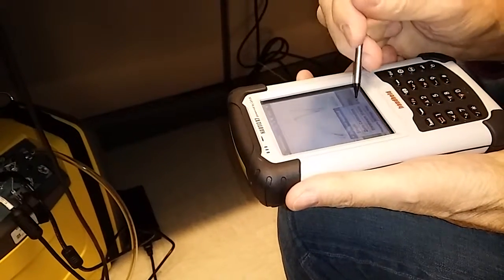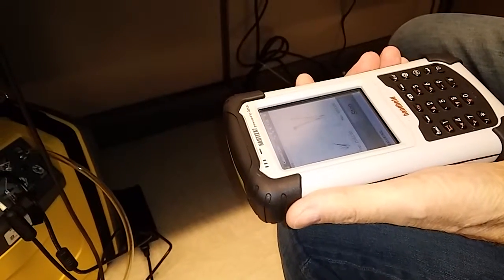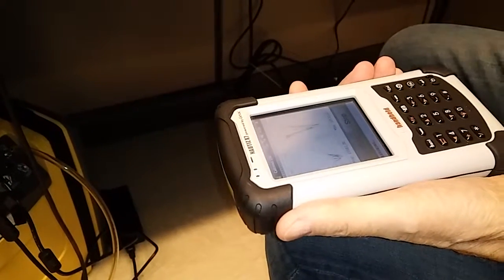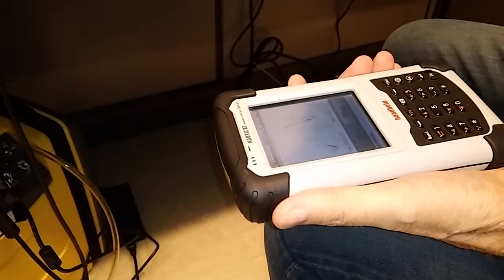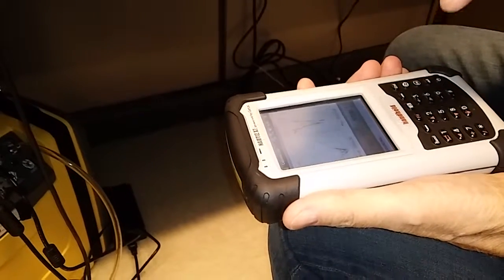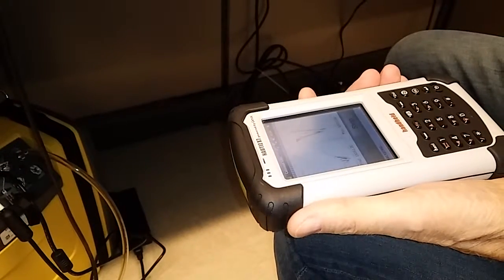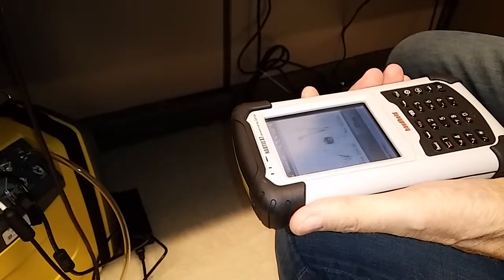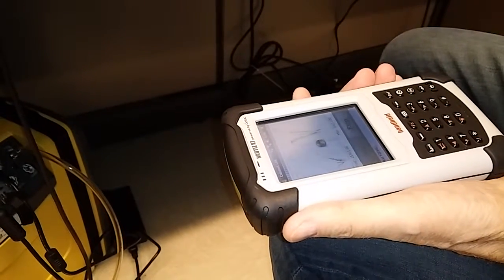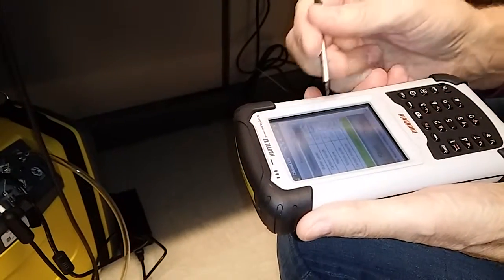Now let's go to measure. Let's do another single sample and see what happens if it changes. In our extended library, we do have the anesthetic gases. In this PDA, we have nitrous oxide only, but you guys don't do any of the other stuff. Don't you have a nitrous oxide gas in your office? No. Oh yeah, I do. Okay. Can we check?